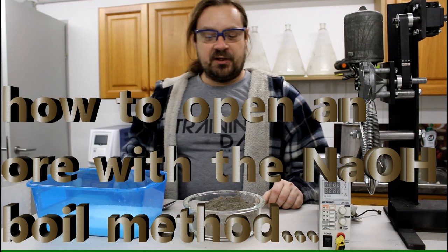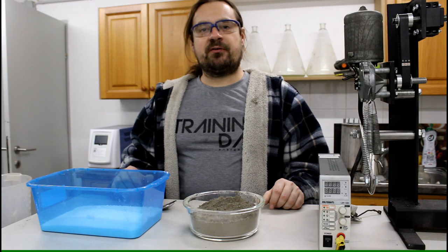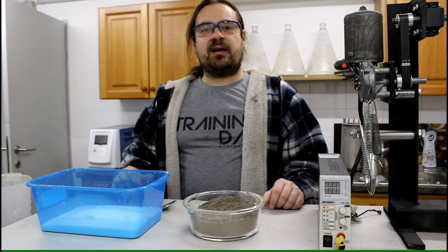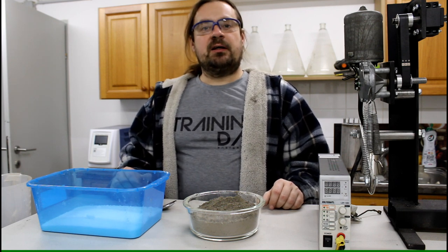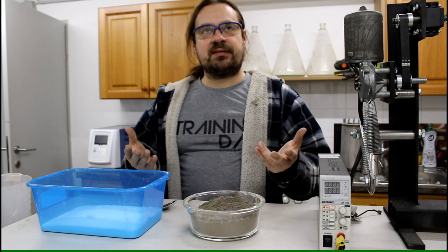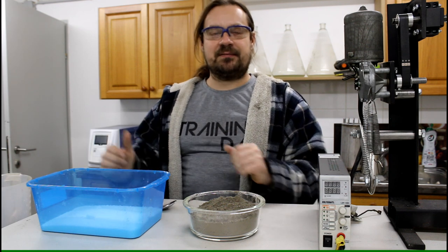Hello everyone! Today I'm going to show you a method how to open up a mineral on the alkali side. There are actually three methods, at least three methods I know of, which are quite useful in extracting minerals or opening up minerals on the alkali side.